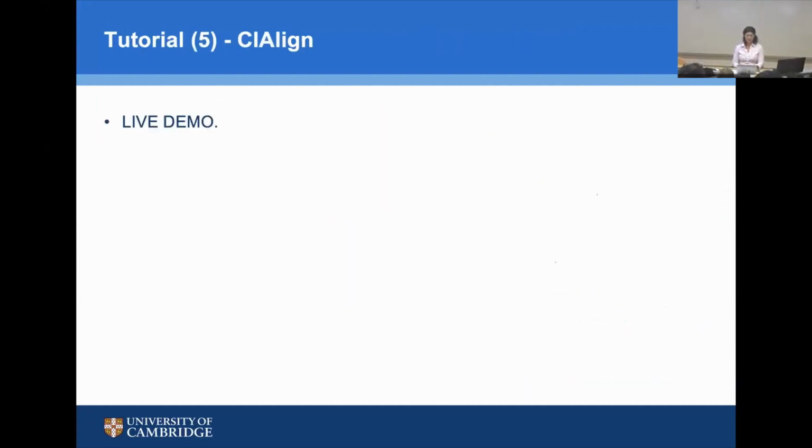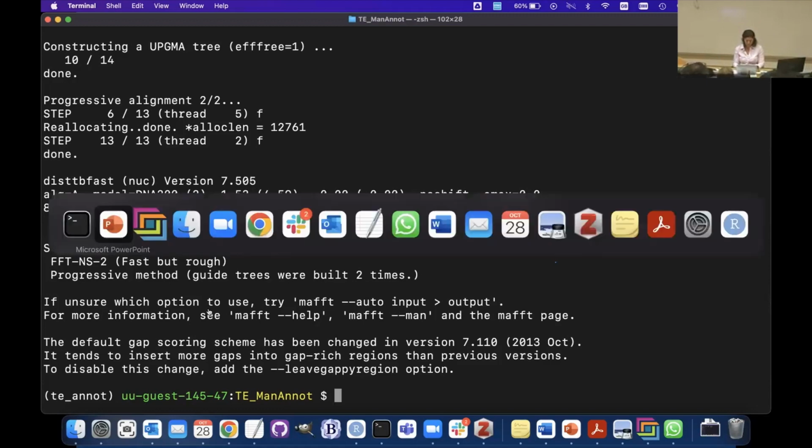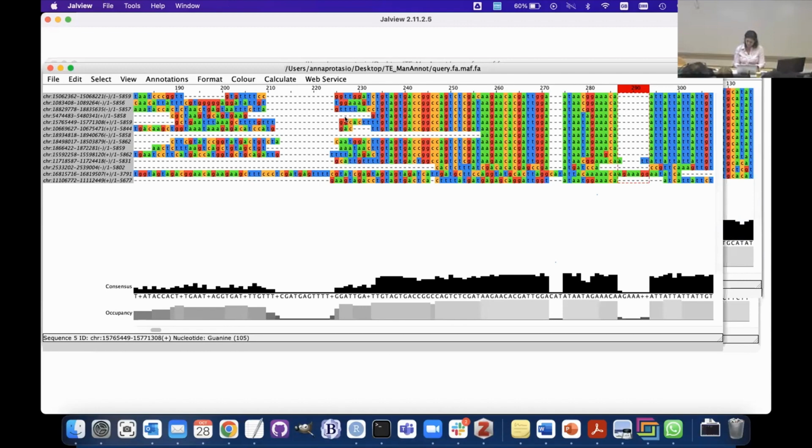So I'm going to give the live demo of CI Align, and I am following Kathy's advice on this. She was very helpful in providing parameters that we can use. They have tried them out. So we were here, right? This is where we were.